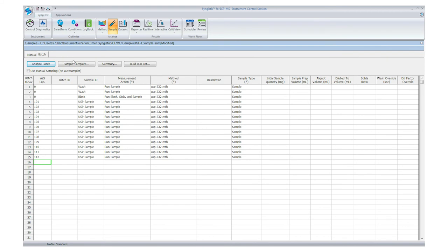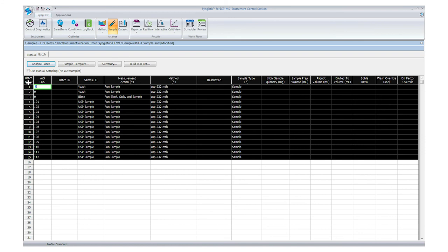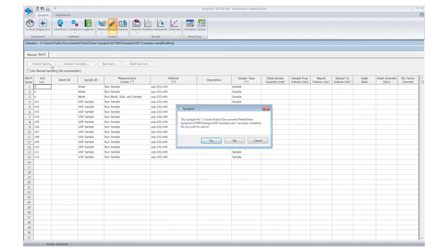As you can see here, I have a list of samples with their names, the location on the autosampler, and the method I want to use. To run these samples, you simply click on the top left corner to select them all, and then click on Analyze Batch.